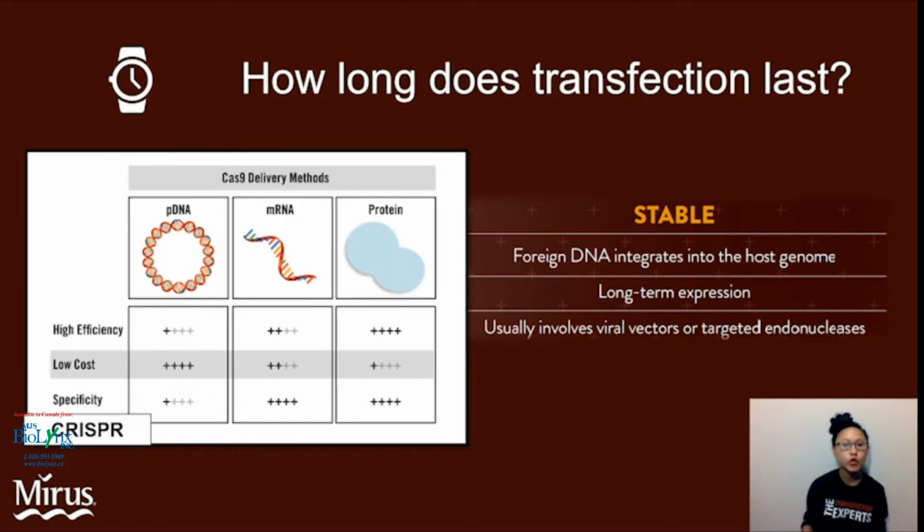And it's the same with CRISPR-Cas9 and other genome-modifying enzymes. Transfection is one of the first steps. You need to introduce those modifiers somehow, so you can do that by introducing plasmid or mRNA that encodes a protein, or the protein itself in some cases, like with Cas9. Often Cas9 ribonuclear protein complexes are transfected.